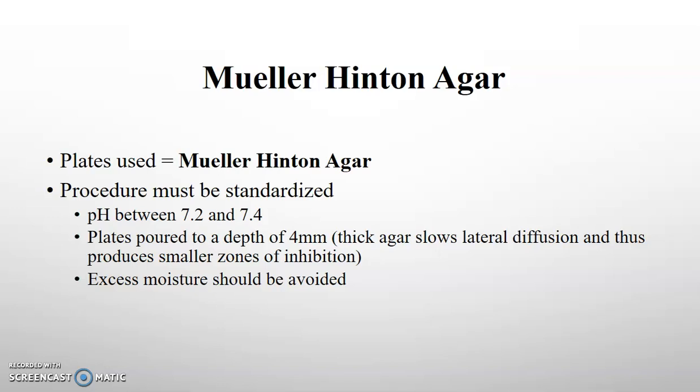So these plates are standardized. There's a lot of things we have to watch for with these plates in order for them to get the appropriate test, because the Kirby-Bauer test is really important. It is a test that's going to tell us which antibiotic is going to be the best one to give a patient.